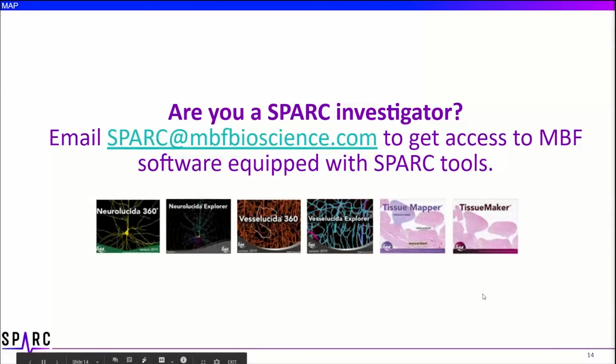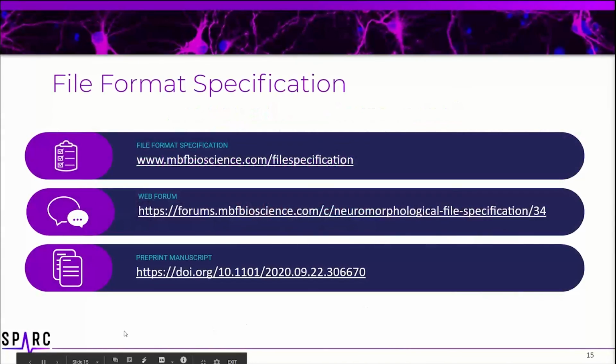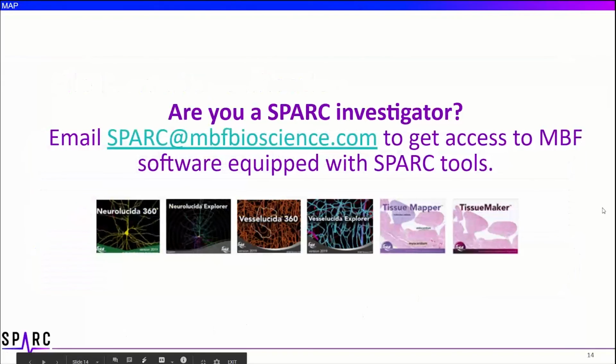Well, that wraps up our demonstrations for the latest FAIR vocabulary tools in MBF Bioscience software, including Neurolucida 360. These tools are soon going to be released to the general public, so keep your eye out for the next NL360 release that has these FAIR tools in them.